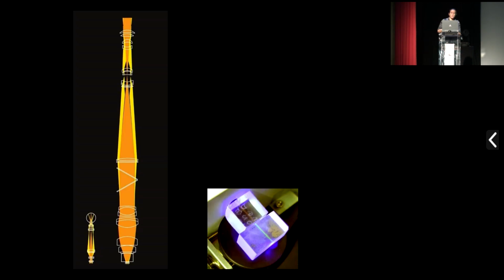We design the prescription using Zemax like all other objective lens designers. And then we take our prescription to a factory in Wales and we batch select each one of the individual glass types. There are 10 different types of glass in the Mesolens prescription, and we test it for low fluorescence.